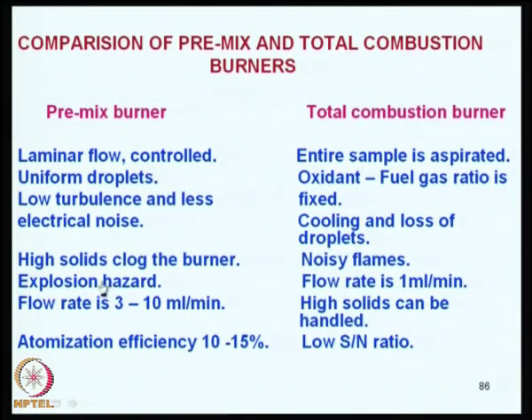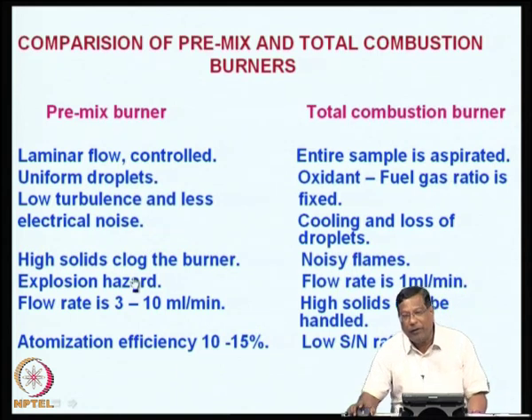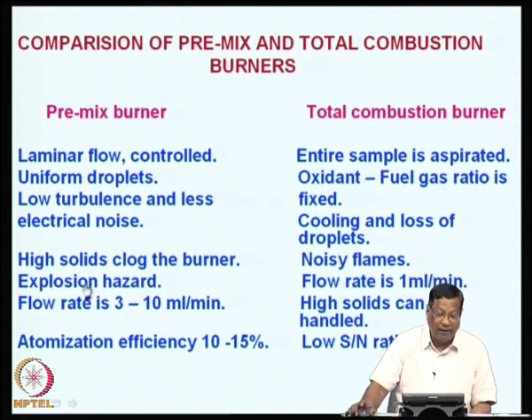Now, in the previous slide, what we have seen is this may lead to explosion. In general, still it is preferred, because the burner heads are usually cleaned for almost every operation if there is suspicion of clogging. These things happen only when you are analyzing high solids substances, that means samples containing high solids such as sea water, urine, plasma, serum, etc.